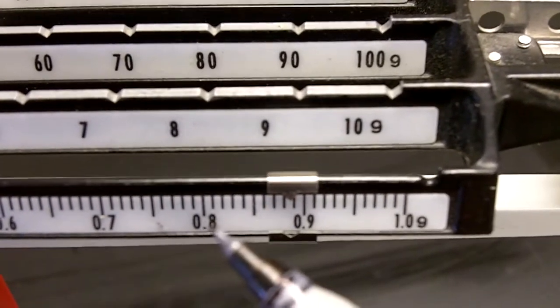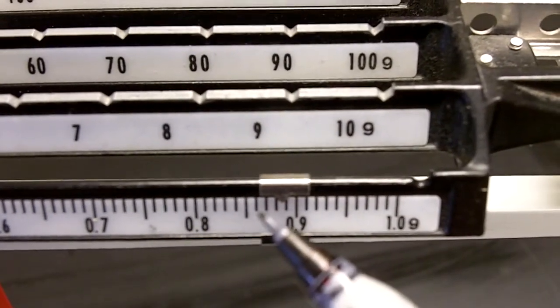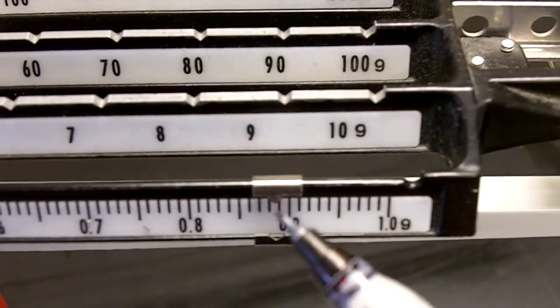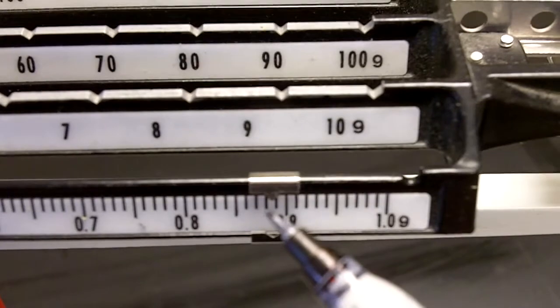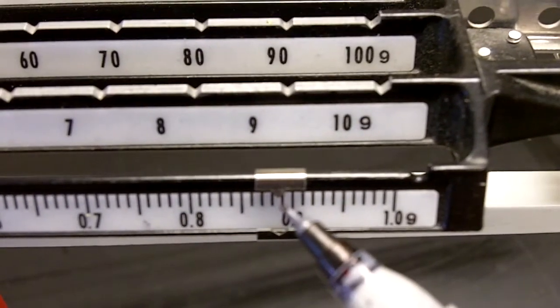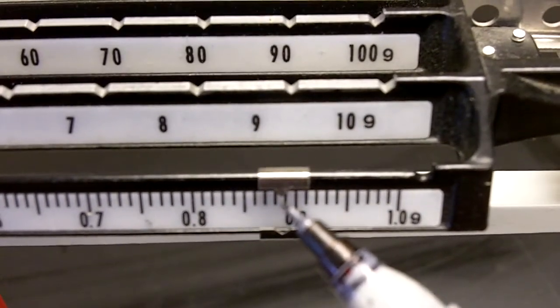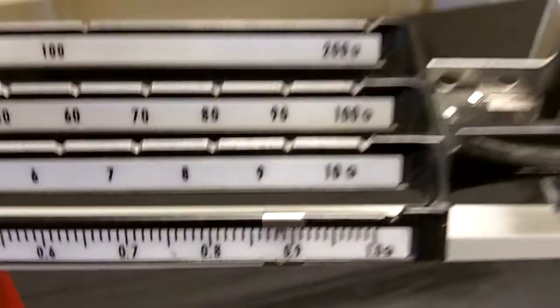Well, how many lines towards 0.9? It's kind of like money. So 44.85 is right there, that big line, and then 44.86, 44.87, 44.88, 44.89, almost. This can read to 1,000th of a gram of accuracy. So pretty much it's a little bit in between 44.88 and 44.89. So we're going to call this 44.886. So let's write that answer up so you can get a look at it.